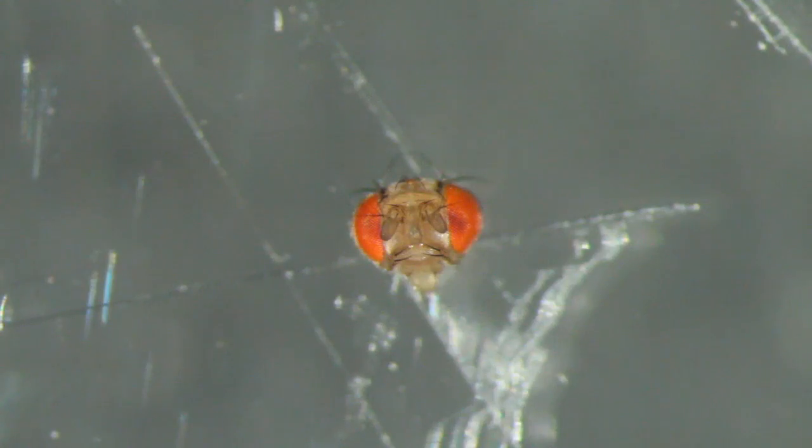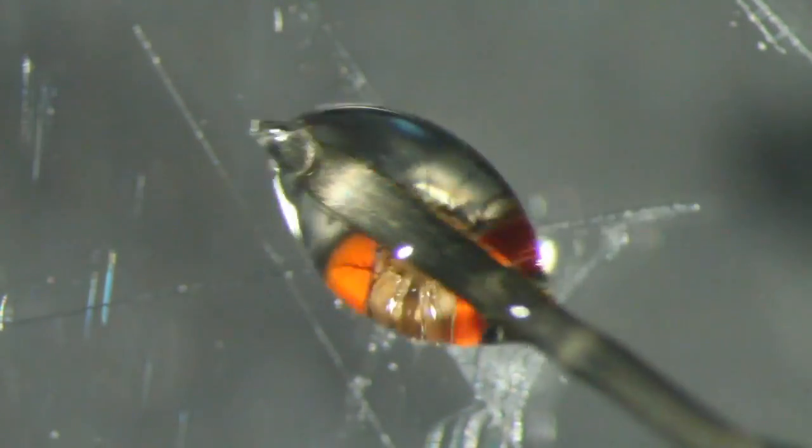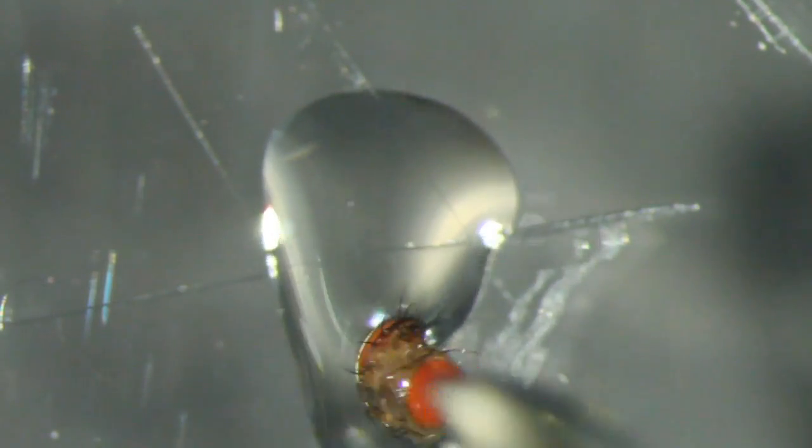Pick up a droplet of resin about the size of the fly's head with a wire tip. Cold anesthetize the flies for less than 30 seconds, lie the fly on its side, cut off the head with a blade and place the head on its posterior surface. Apply a droplet of resin to completely cover the head.